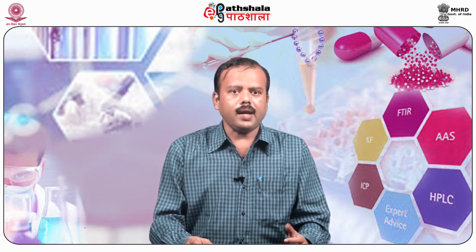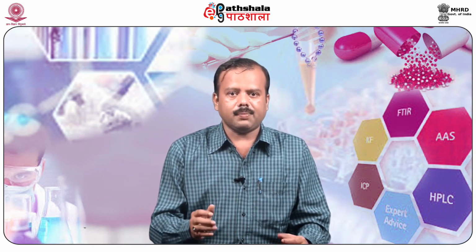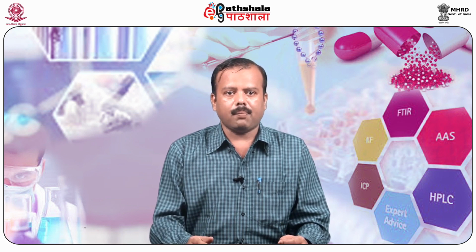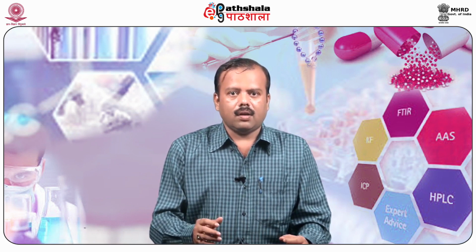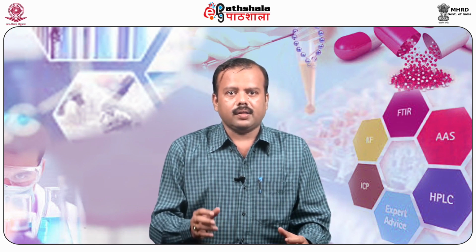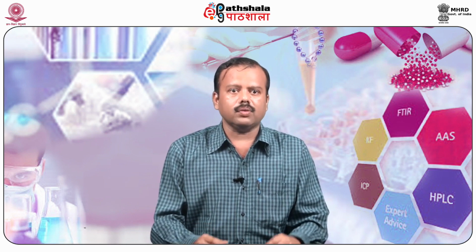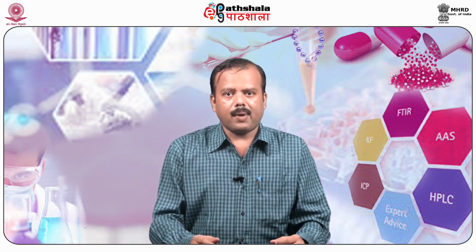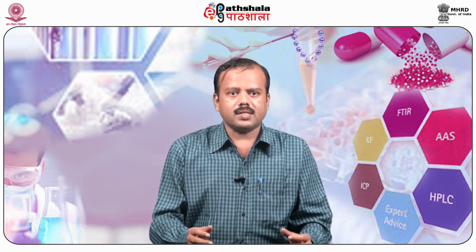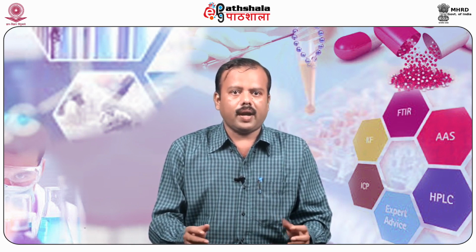Number 2, to obtain the phenol coefficient. Determination of the concentration of a disinfectant required to produce a particular result, compared to the activity of pure phenol that gives the same result. Number 3, to confirm that the antimicrobials are active at the concentrations recommended for use, also called the use dilution test. The performance of the test disinfectants is compared to that of hypochlorite.